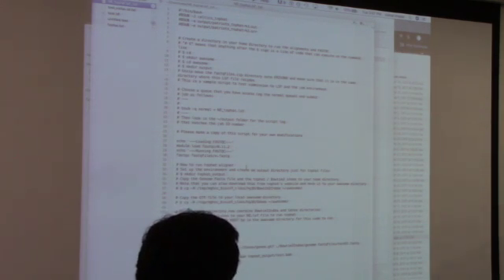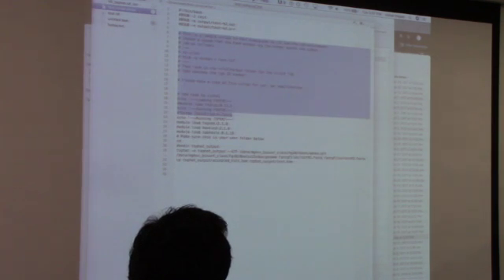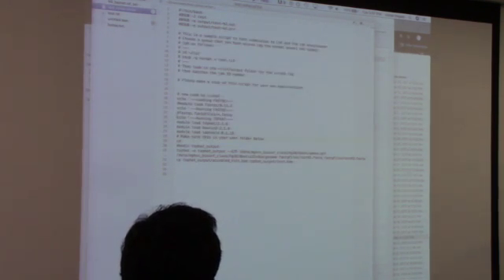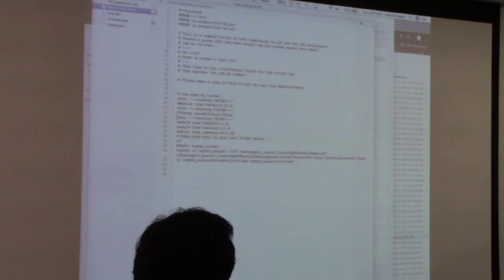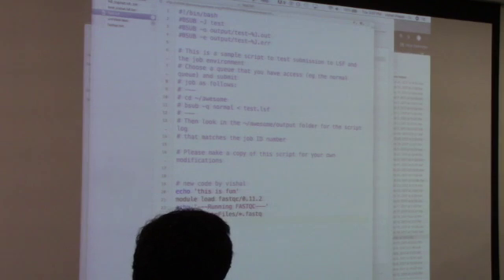So now, given our new file which contains all this extra stuff, we're going to add some stuff from that into this file. This is the set of lines all the way from, what was it, test Vishal, is that the one we opened? Yeah. Okay. So we're going to add these lines which say echo running TopHat, module load, and so on. We're going to copy that and then paste it in our test.lsf.